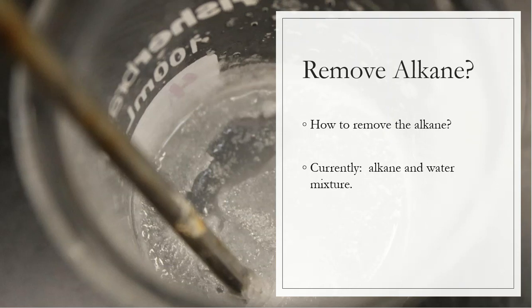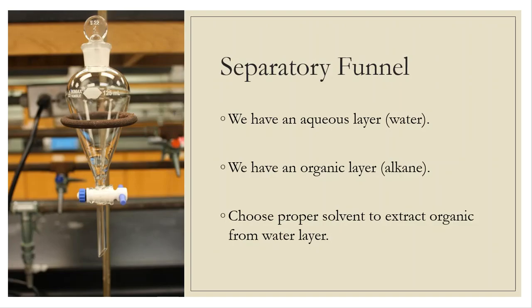I need to separate those two layers, so therefore the lab tells me to separate it using a separatory funnel. And this is one of the reasons that we do that. It's the whole reason that we use a separatory funnel. That's why we call it separatory in the beginning. All right. The only thing is that I'm going to have a proper solvent.